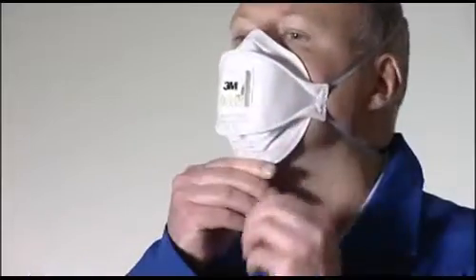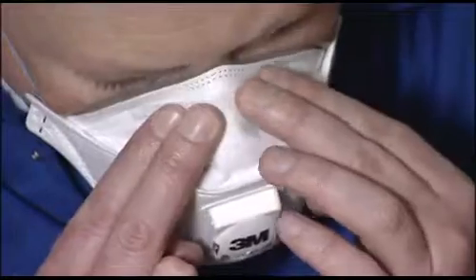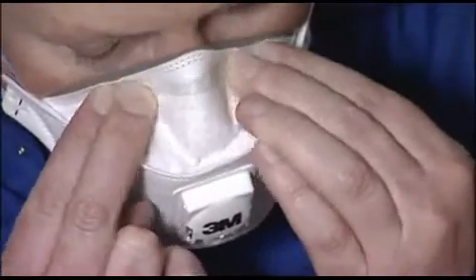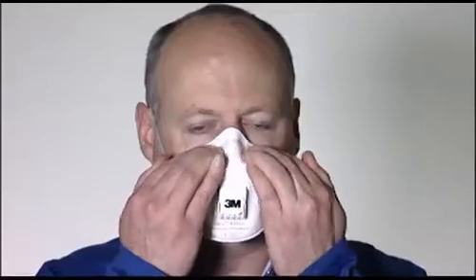Adjust the top and bottom panels for a comfortable fit, ensuring that the panels and tab are not folded in. Using both hands, mold the nose clip to the shape of the nose to ensure a close fit and a good seal. Pinching the nose clip with only one hand may result in less effective respirator performance.